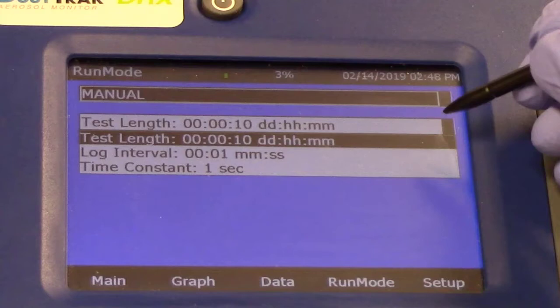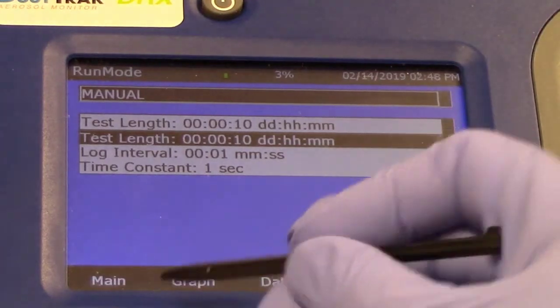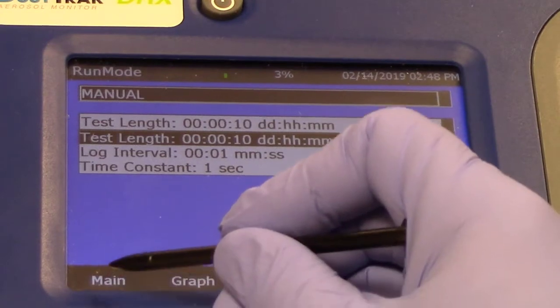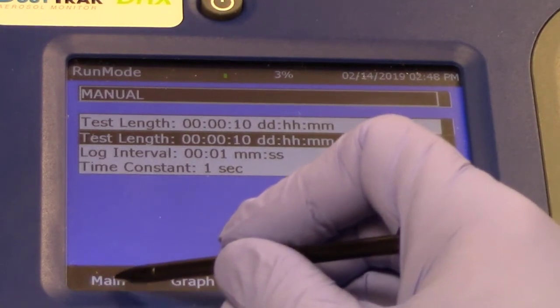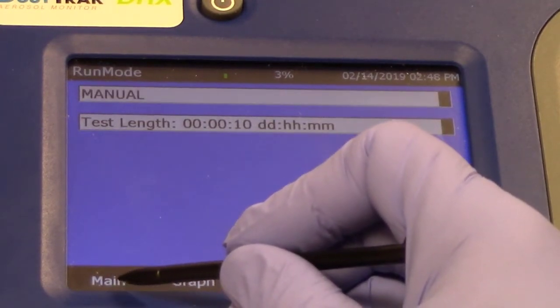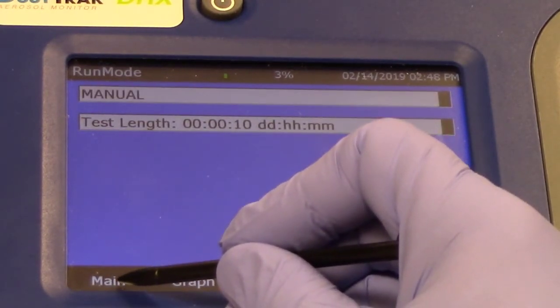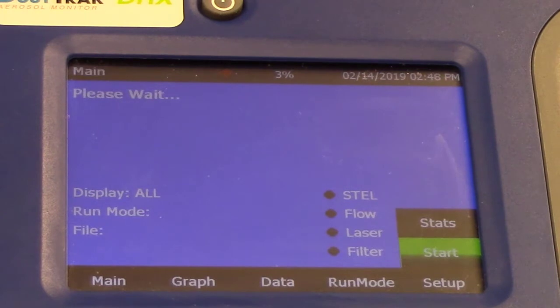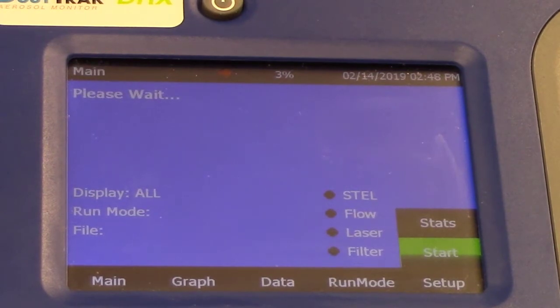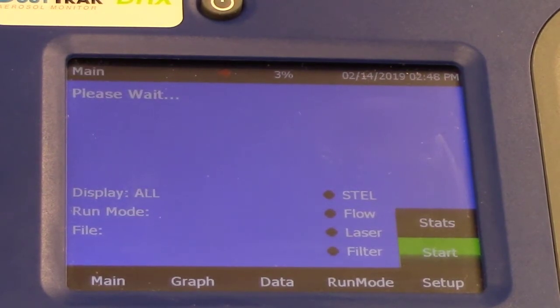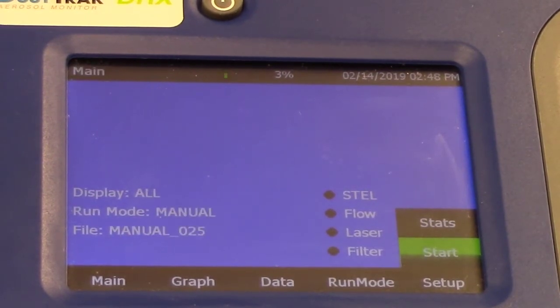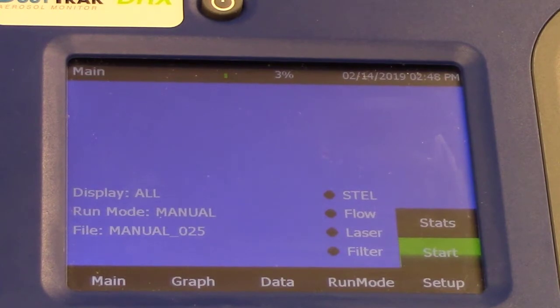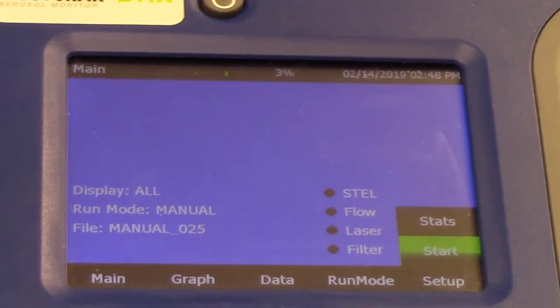As you can see on the screen, there is a test length, a log interval and a time constant. Time constant is the time across which the data will be averaged. Once those are done, you can hit start to start taking the measurements.